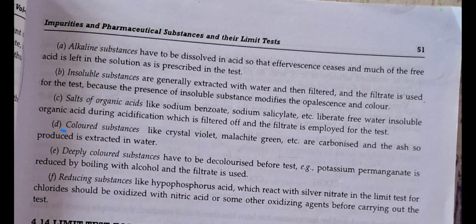In the case of colored substances, for example crystal violet and malachite green, which are naturally colored, the substance is first carbonized and the ash so produced is extracted in water.